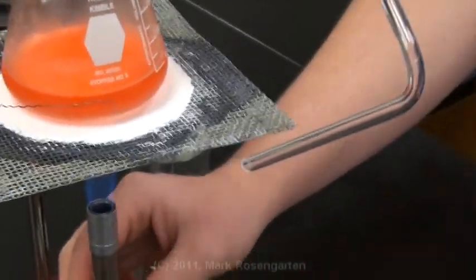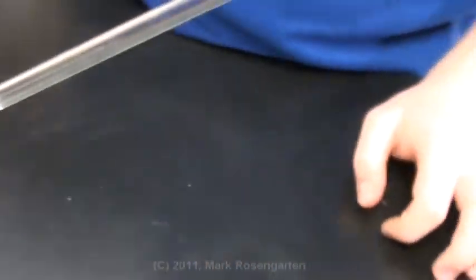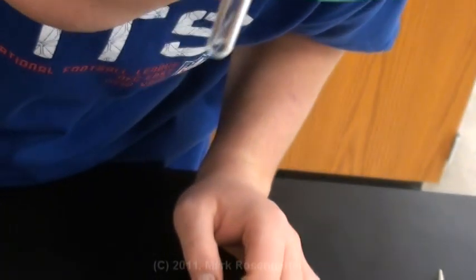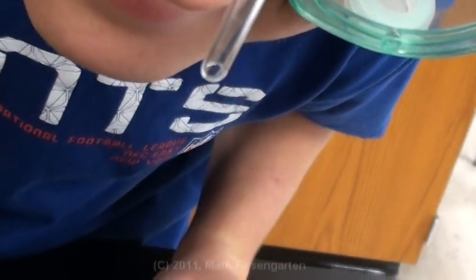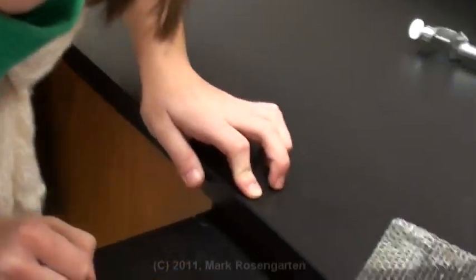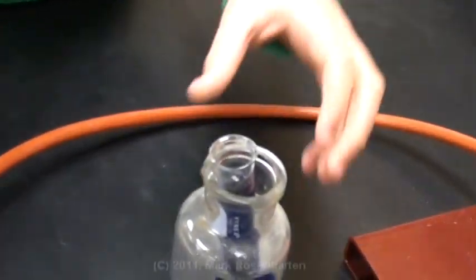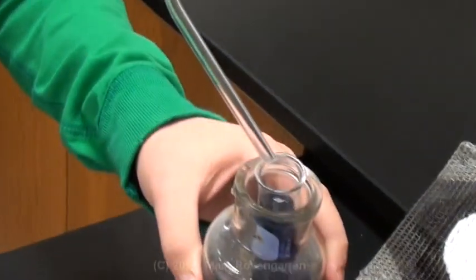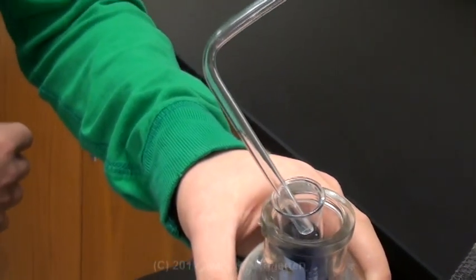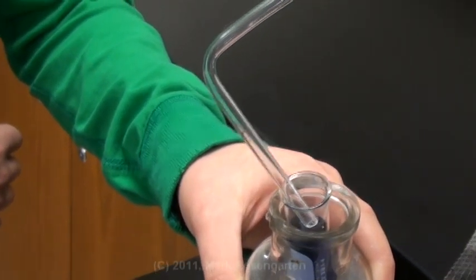And one person should smell the tip immediately, shove their nose under the tip, and give a sniff. Now, record the temperature. As soon as you smell the ester, record the temperature that it comes off at, and immediately place the bromethymol blue test tube in there to test for carbon dioxide coming out, so that the tip of the tube is in the liquid.